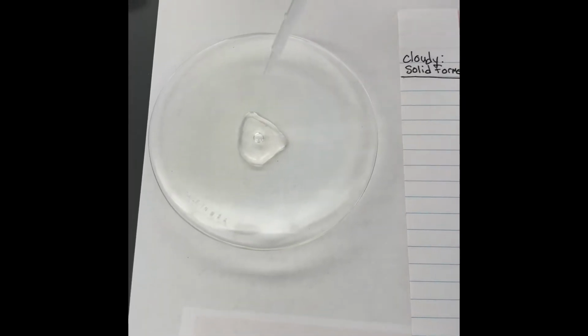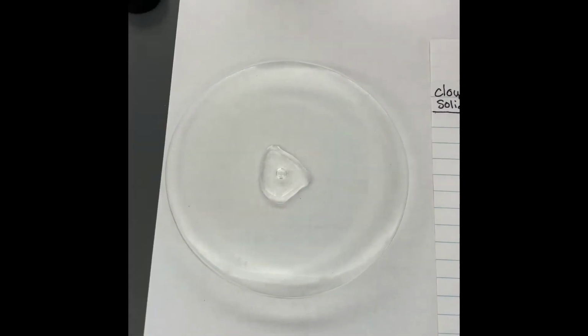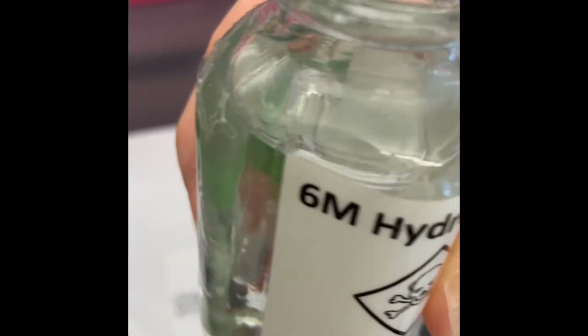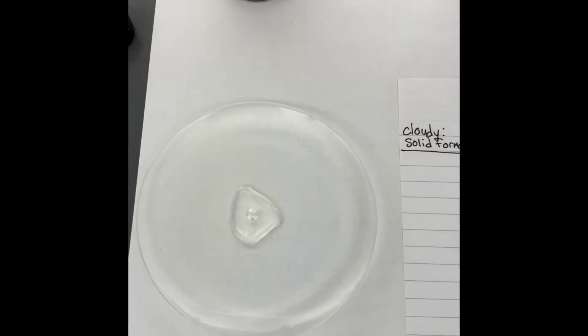Right, note that this is clear and colorless. We weren't able to see before from the brown bottle. Also note that this hydrochloric acid is also clear and colorless.